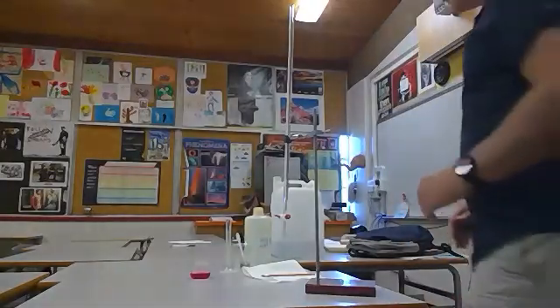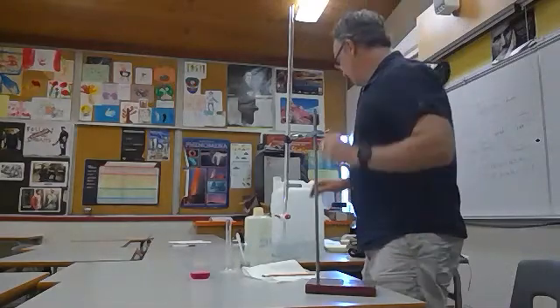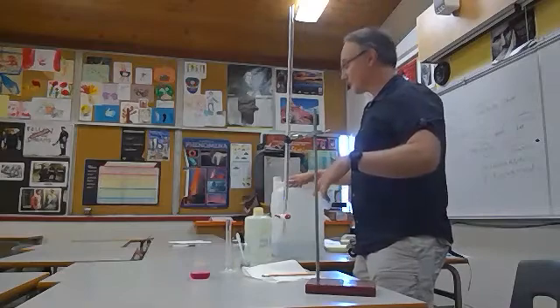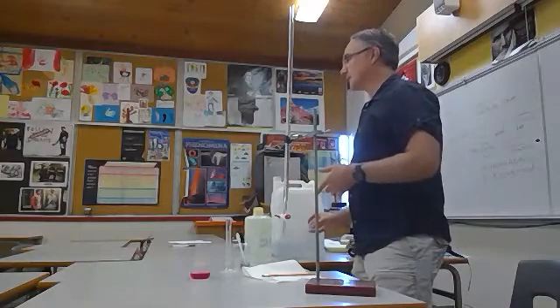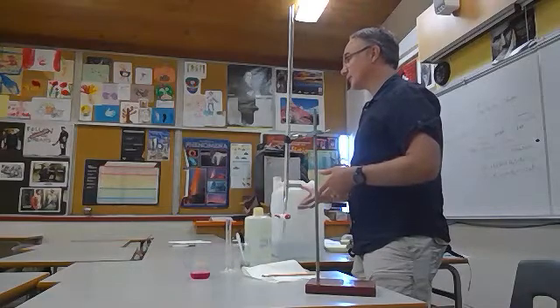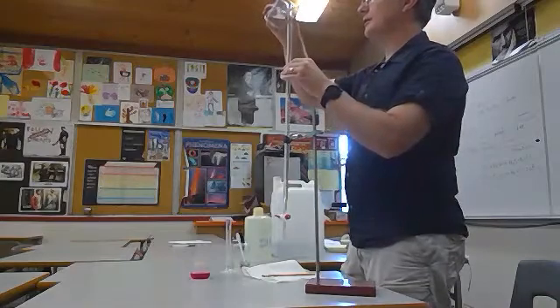Okay, so this is the burette, and we'll have a chemical that we're going to use to titrate the other chemical. The chemical we're using is sodium hydroxide, and the molarity of this we know is 0.1. So what I do is I pour this into the burette.